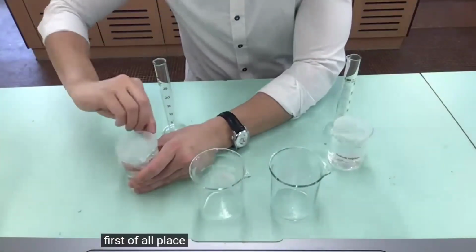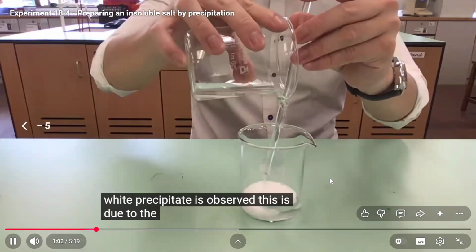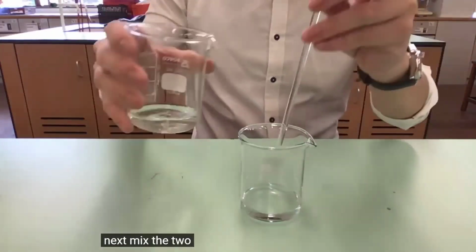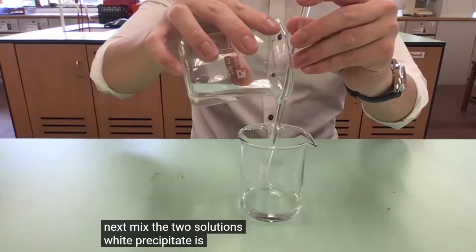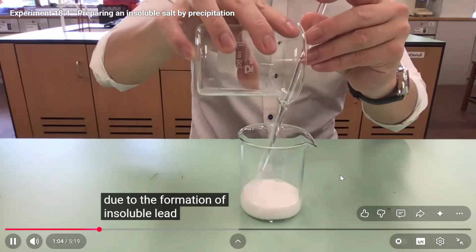First of all, place 20. Actually, they're just measuring. Sorry. Two solutions, ठीक है। Mix the two solutions. Now see, a white precipitate is observed. This is due to the formation of insoluble lead-2 sulfate.